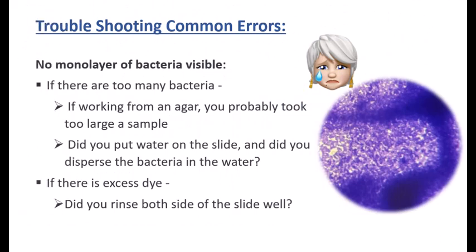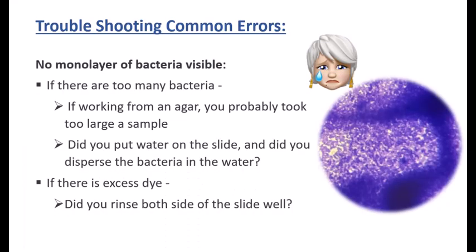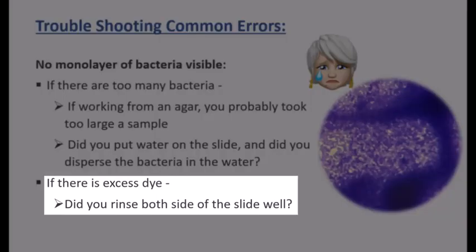If you look under that microscope and you can't see a monolayer of bacteria, so you can't see individual cell shapes, there's too many bacteria on the slide. If you were working from an agar, you probably took too large of a sample. Or perhaps you forgot to put the water on the slide or just didn't disperse the bacteria in the water very well. The other thing that could have happened was too much dye left on the slide, meaning that you didn't rinse both sides of the slide very well.